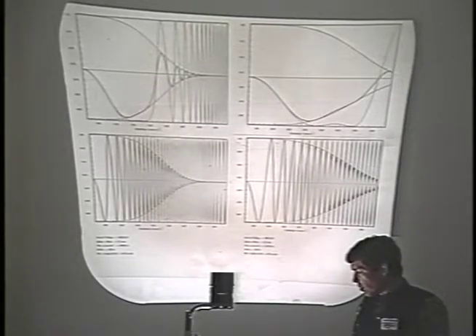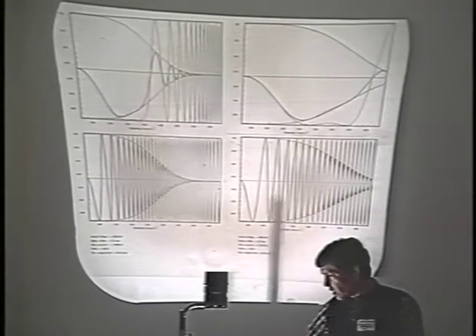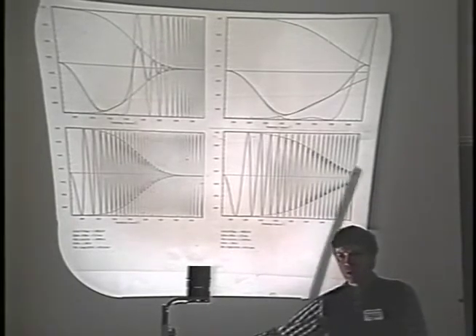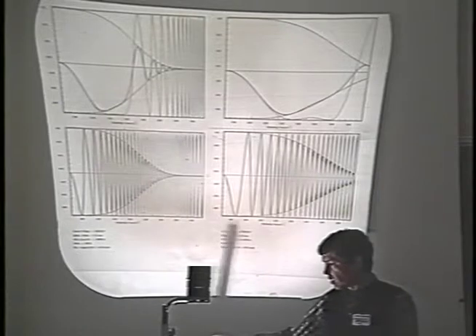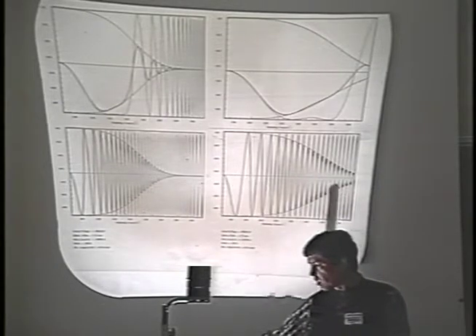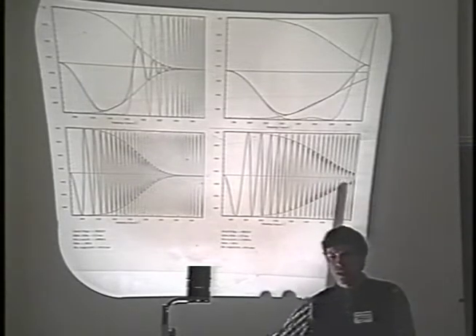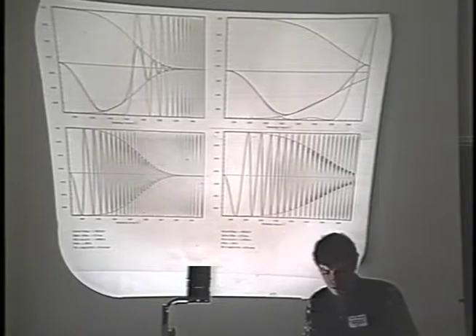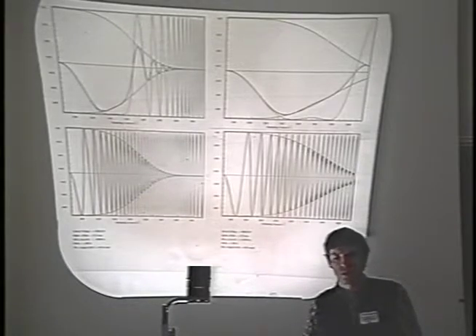Now, the bottom line here is that these oscillations occur much more slowly at high voltage than they do at low voltage. What that means is that you can change the focus more without changing the position of the sine function at high voltage. So that has two aspects. One has to do with how much vibration of the stage you can deal with.